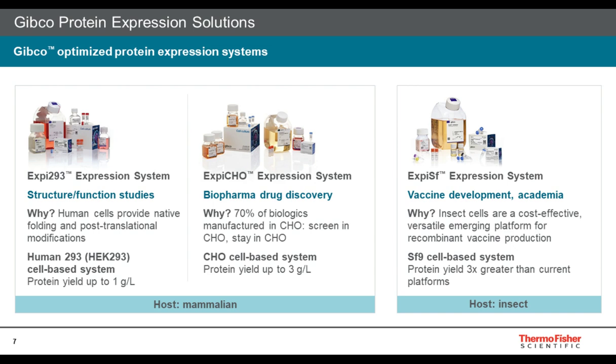I've outlined 3 different commercial expression systems that have been adapted to grow to high density in suspension, eliminating the need for the end user to do this, and optimized to obtain maximal yield from mammalian and insect cultured cells. Human 293 cell system was developed especially for end users performing structure function studies that require native protein folding and post-translational modifications.